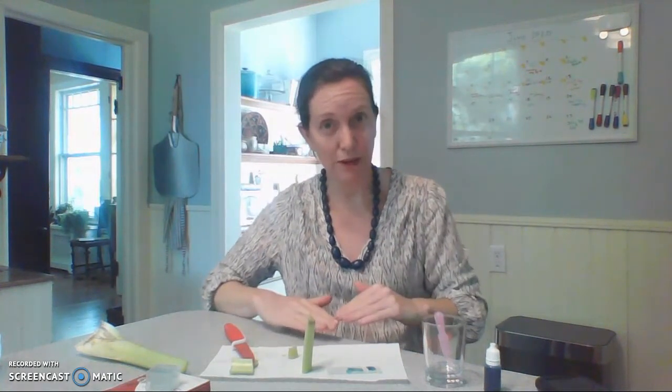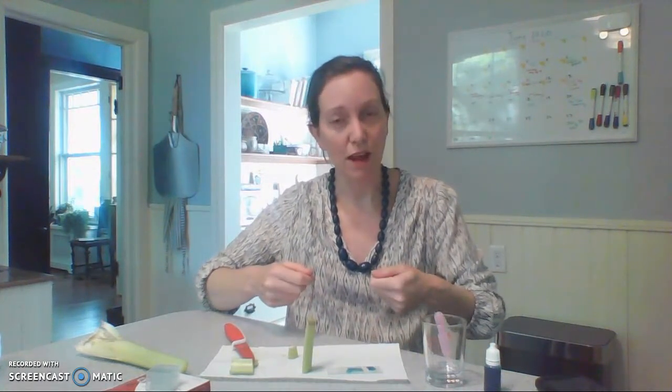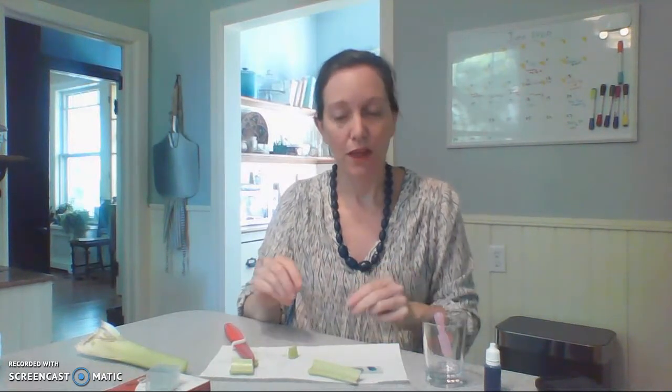When you use the microscope to look at these specimens, always start with the lowest power objective and the stage all the way down. Then bring your stage up with the focus knobs — the coarse one works best at low power. Once you can see the specimen through your eyepiece, use the fine focus knobs. Once it's clear, make sure it's centered, then go up to the next higher objective, the 10x, for a total magnification of 100x.